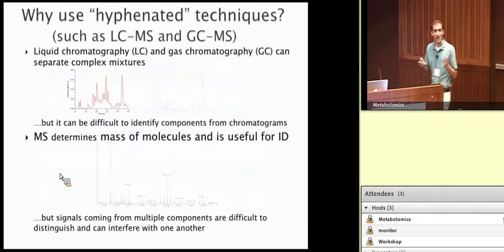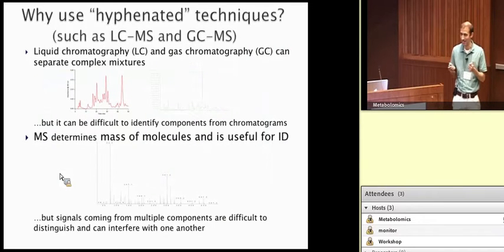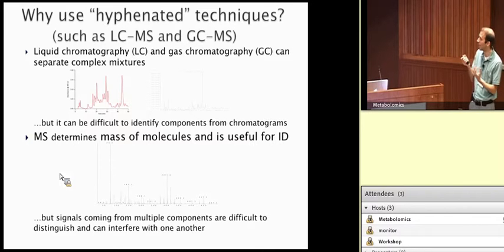Okay, now hyphenated techniques. What is a hyphenated technique, and why would you want to use it? Well, a hyphenated technique basically just means you're putting two analytical methods together in a direct coupling manner. It can be offline, but usually it's done online so that they're transparent, and when the first technique is done, the second is done as well.